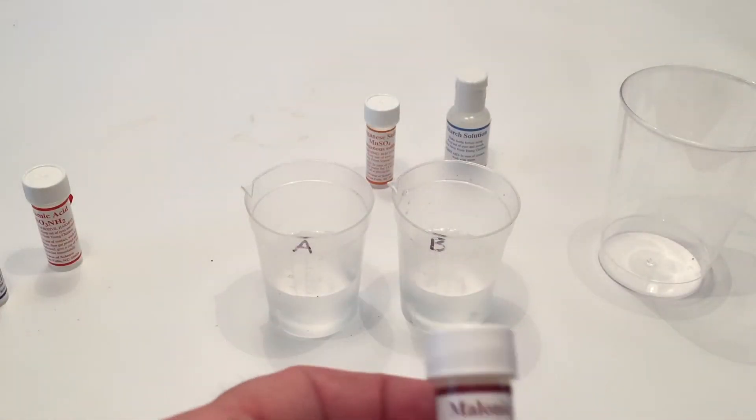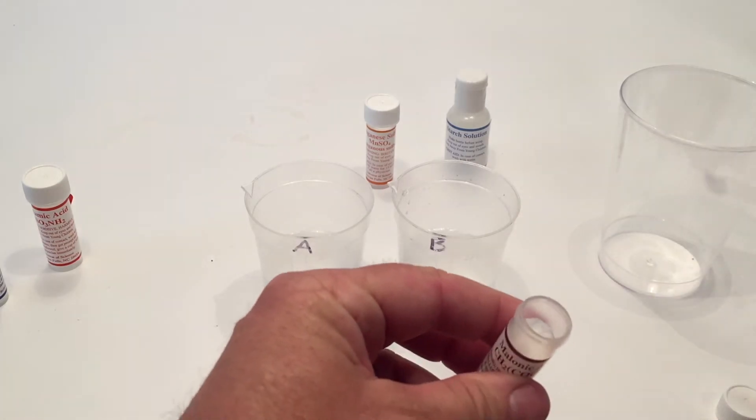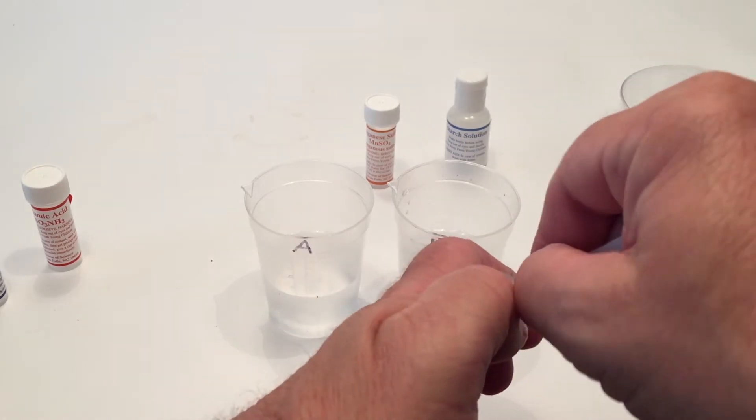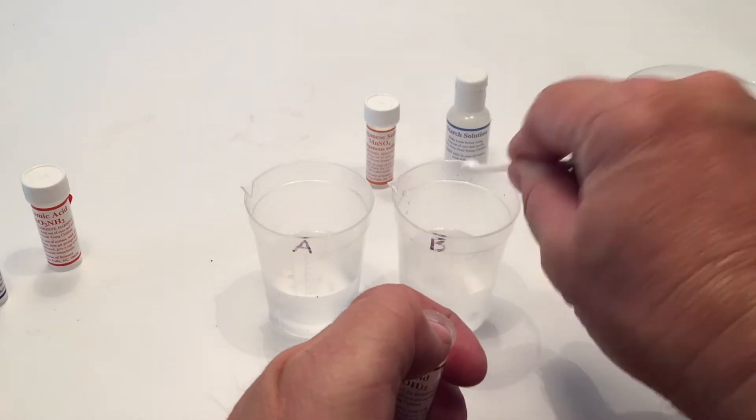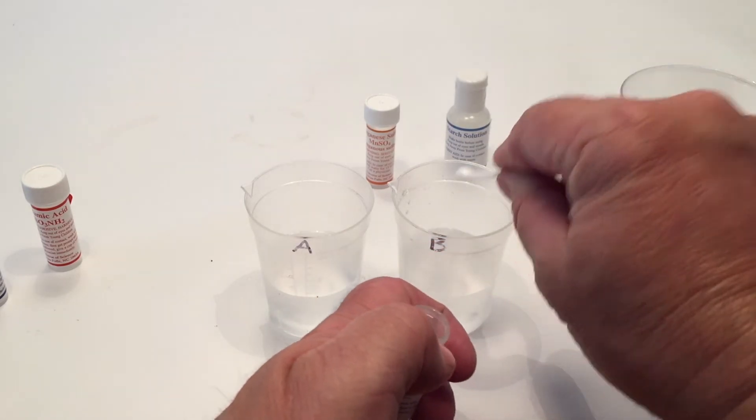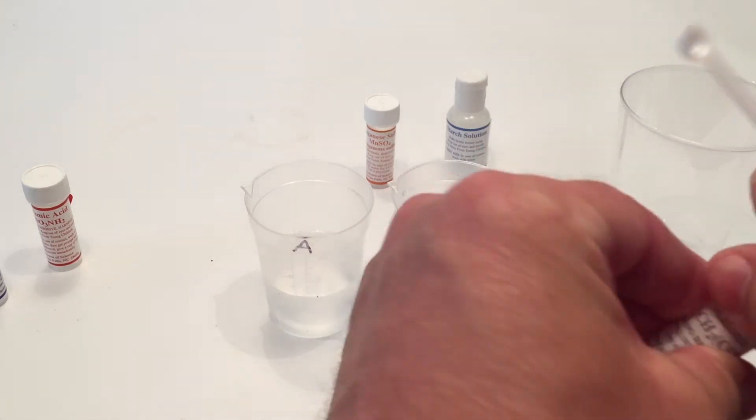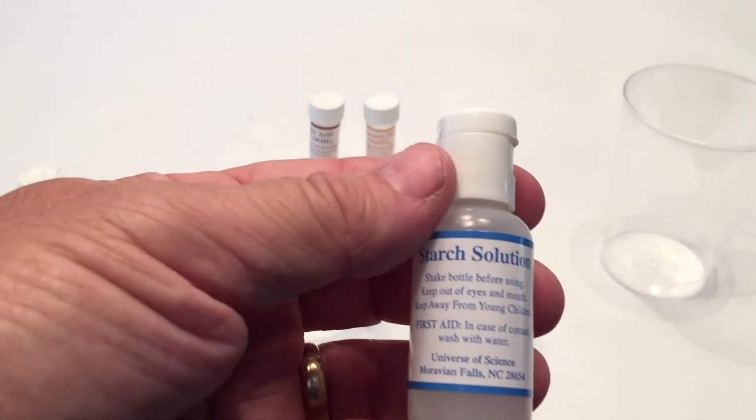And then we're going to do four scoops of the malonic acid. So four scoops here, I'm adding into cup B. Make sure you don't have it too high. I'm kind of just pat it down so it's a good scoop. And once we get those four scoops in, then we're going to want to stir that solution so it's completely dissolved.